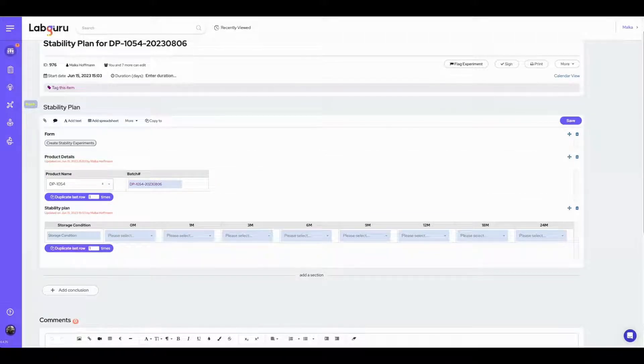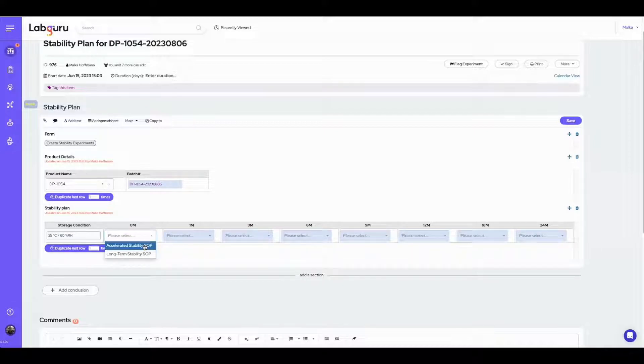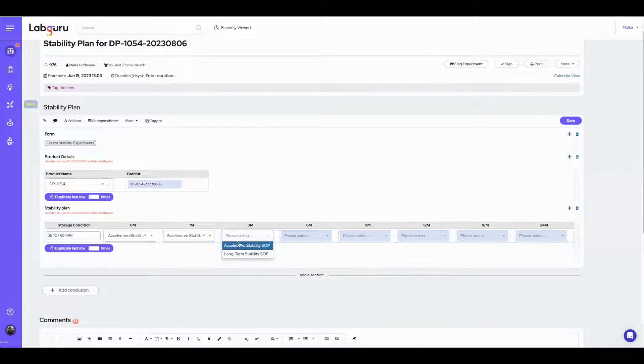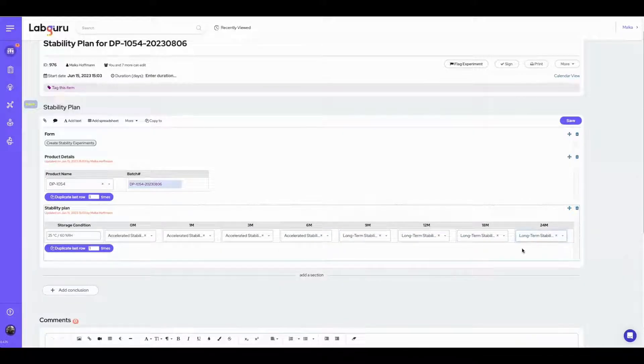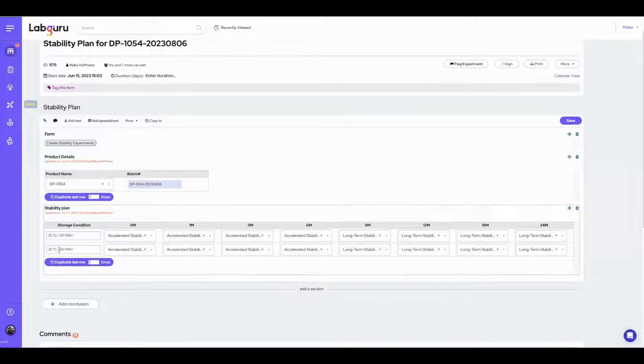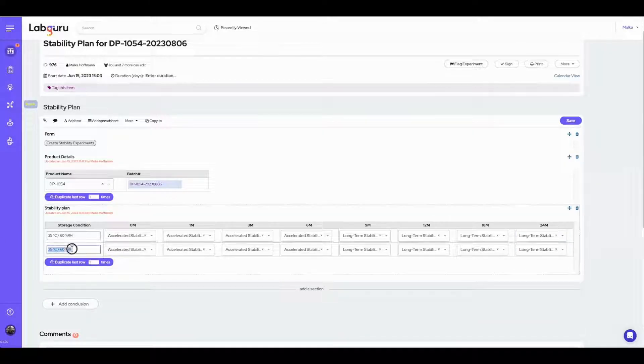I am inserting the storage conditions and choosing from the dropdown at each time point the relevant testing SOP. You can customize the list according to your own SOPs, protocols, and product-specific stability plans. You can add additional conditions to your table according to your plan.